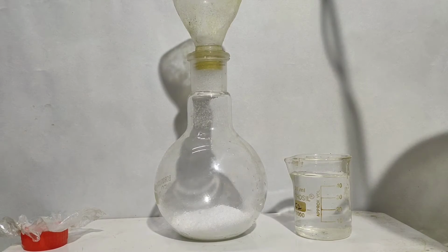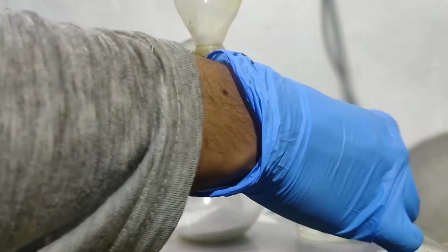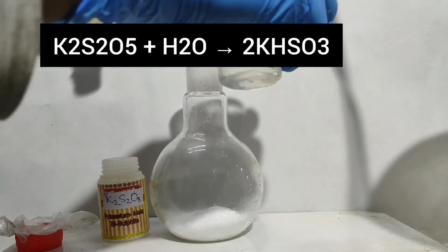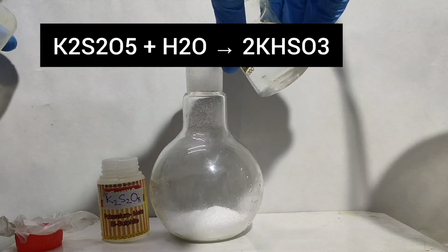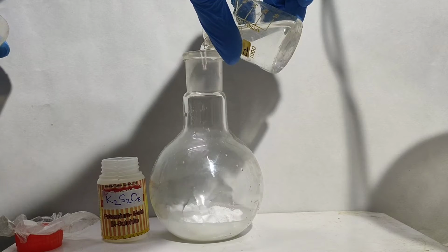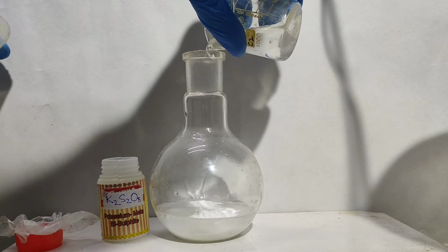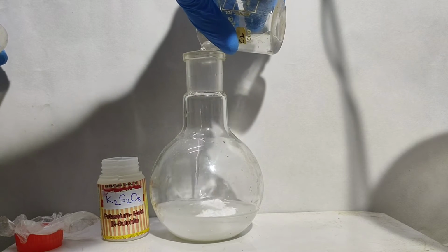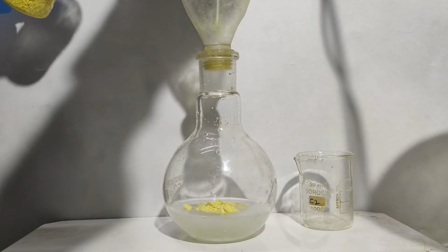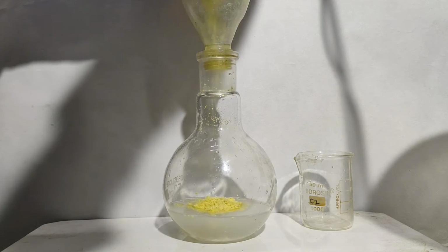On adding water to metabisulfite, it converts into bisulfite, so I started by dissolving 20 grams of potassium metabisulfite in 50 ml distilled water. Like this, the potassium bisulfite solution will be ready. Then to it, I added 6.75 grams of alpha nitronaphthalene.